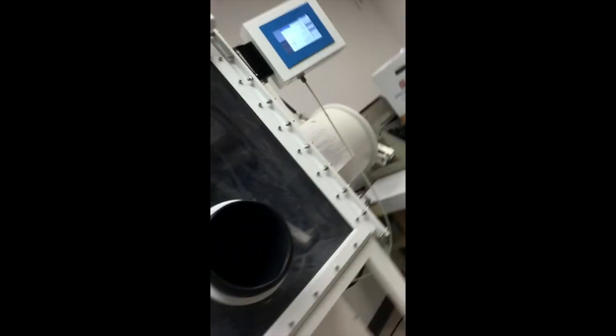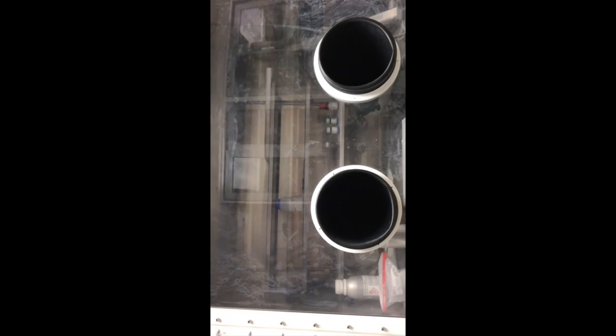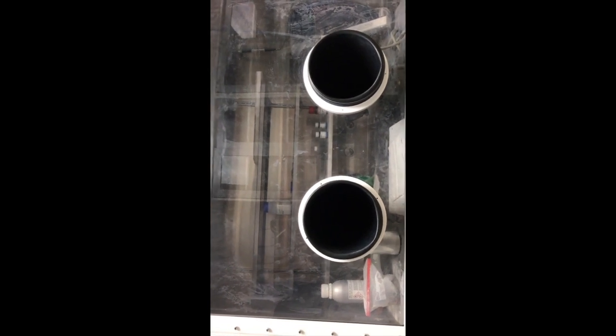And on this side, we have this big thing. It's called a glove box. In this box, I'll try to show you, you can see some containers. We actually put flammable materials there, sensitive materials that cannot be exposed to air. So we put it there. We can use these two black things. They are gloves, so we can manipulate experiments or other things inside the glove box. So this is very, very important to keep the lab safe while we conduct sensitive experiments.